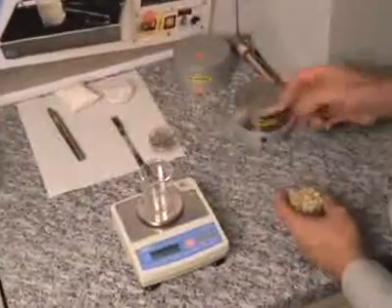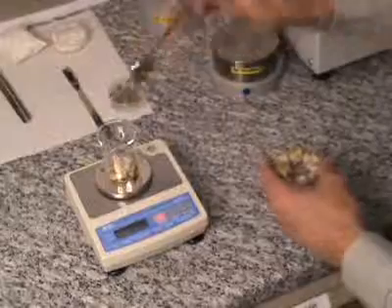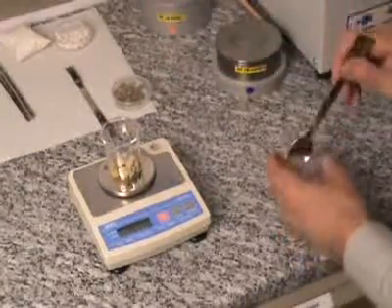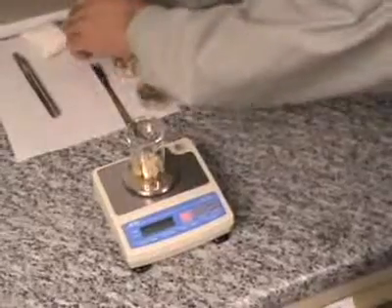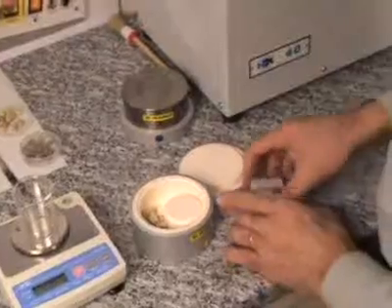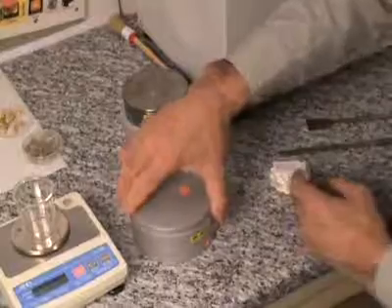Here some quartz rock sample is milled. The starting quantity is about 15 grams. This sample is going to be milled in a corundum vessel. And now 0.3 gram of a pressing and grinding additive based on cellulose is added.